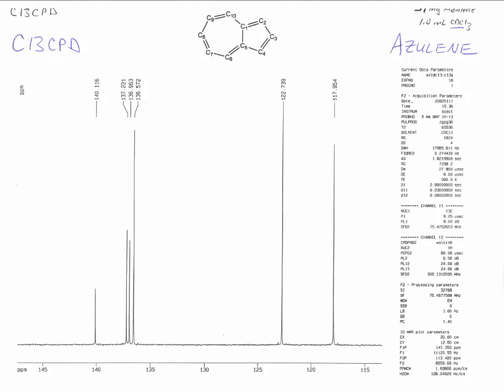And the proton decoupled part of this is very important because if we didn't have the protons decoupled from the spectrum, you would see splitting patterns here, just like we did in the proton spectrum. Because the protons would split the carbon signals just the same way that in a proton spectrum, the protons split each other.